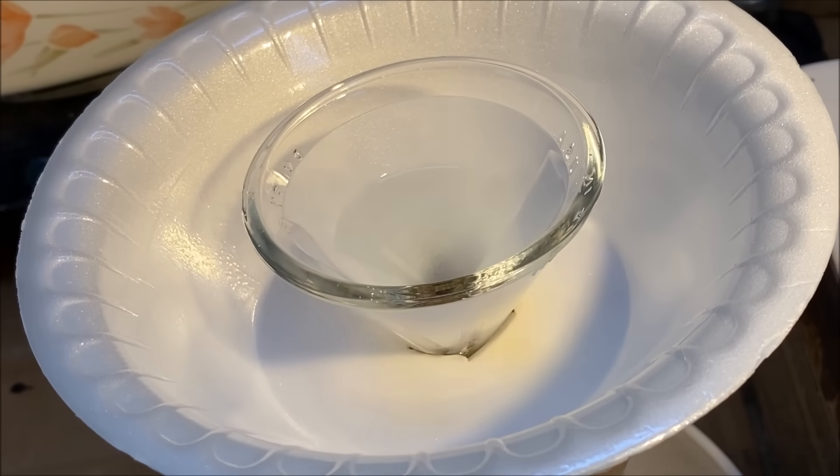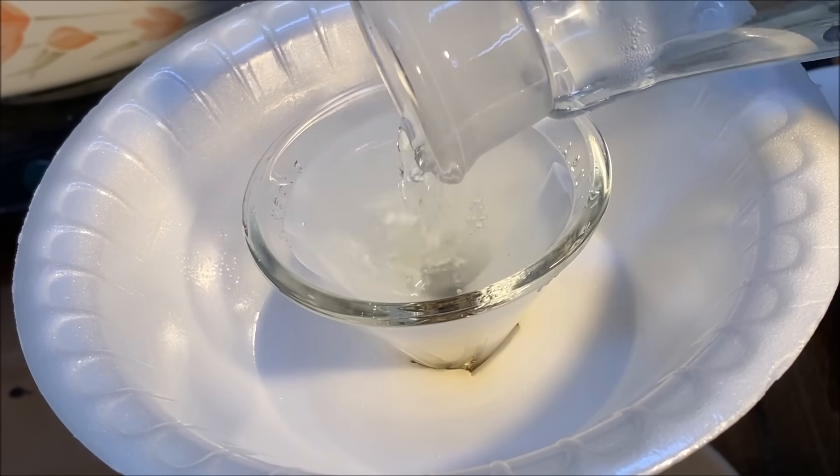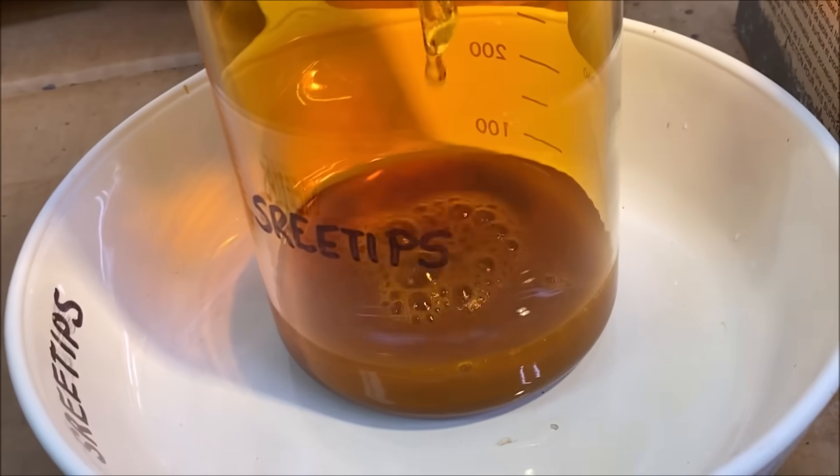I'm dropping the SMB in little by little until we get all of the gold precipitated out of there and those fumes clear up.